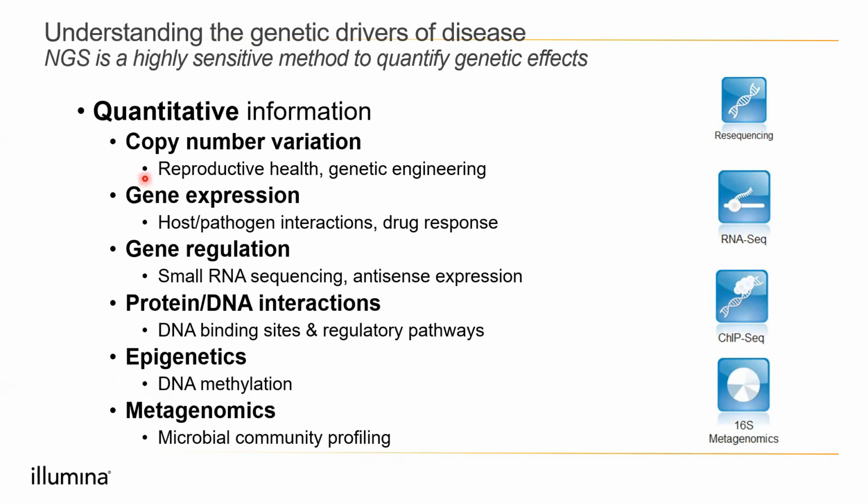You can check for aneuploidies. Basically, this is your NIPT. These are count based methods. The NIPT and PGS that was previously discussed. So this can also be discovered.